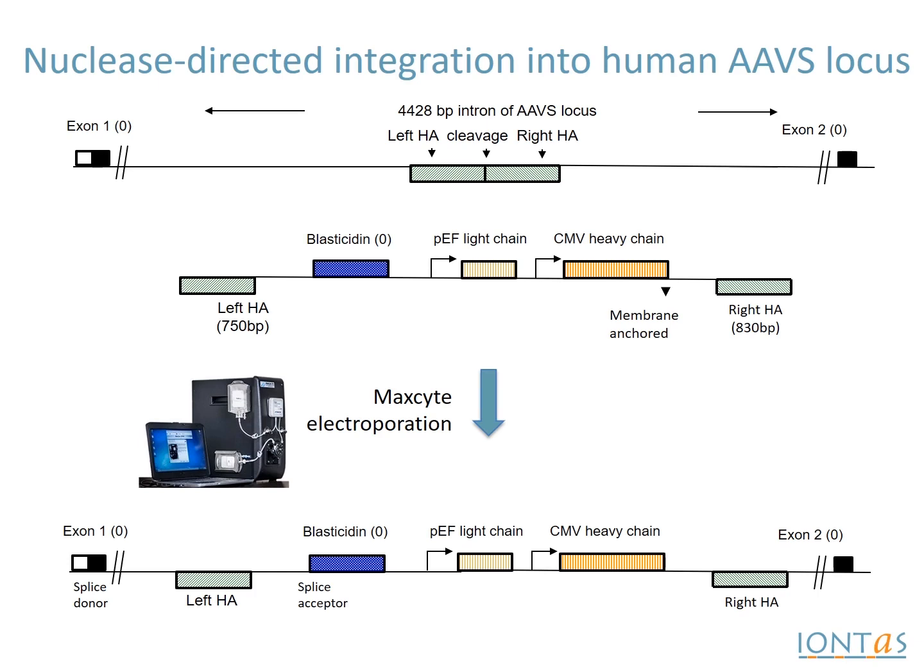So if we look at this, we can see there's a promoterless blasticidin gene. It's promoterless, but it also has a splice acceptor sequence which allows splicing with the upstream exon that was already present within the locus. So this allows a clean up of the background, because in principle the blasticidin resistance will only occur if you get integration with an upstream exon in frame with that.